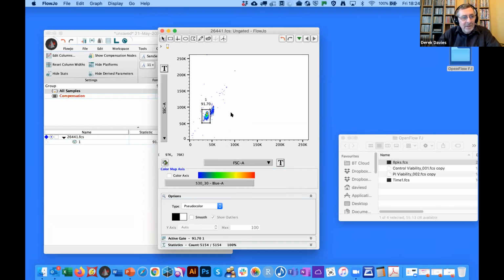One of the things that I think people, especially when they're new to the field, get a little bit anxious about is, how have I set that? The problem with light scatter here is that we don't have a control, do we? I've got no idea where that single bead ends and where it begins. So I'm making a bit of a subjective judgment. We like to think of flow cytometry as this fantastic objective technique, but there are some subjective parts to it, and setting a scatter gate is certainly one of those. But you could argue, why have you set it there and not maybe slightly smaller?